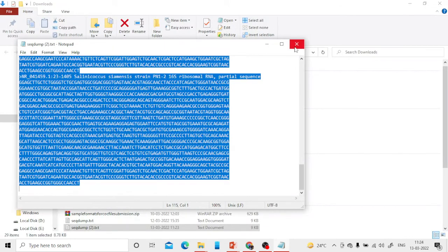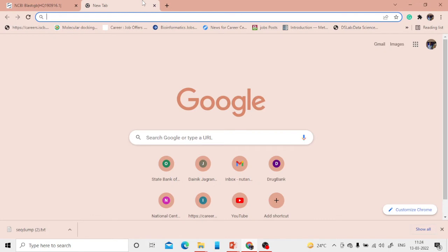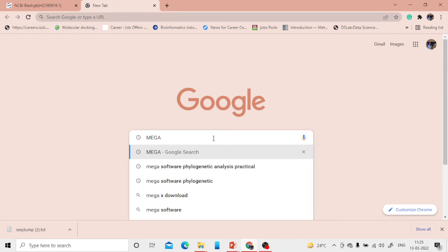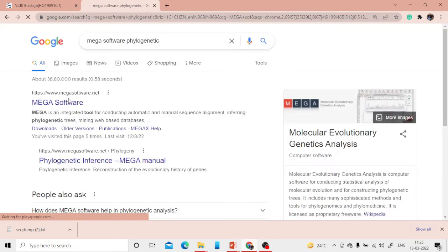Now I've saved the file on the desktop and can close Notepad. You now have your own sequence and the homologous sequences. The next thing required is the software to perform phylogenetic analysis. I'm going to use MEGA — a very popular and freely available software.